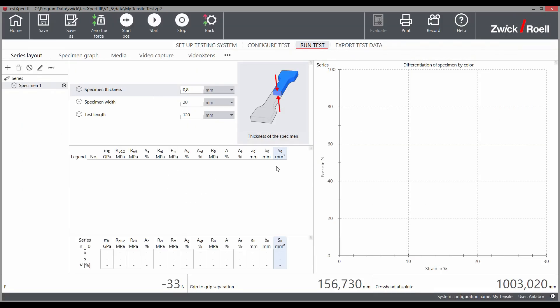Once the test program is loaded, you can drive the machine to the start position of the saved system configuration.